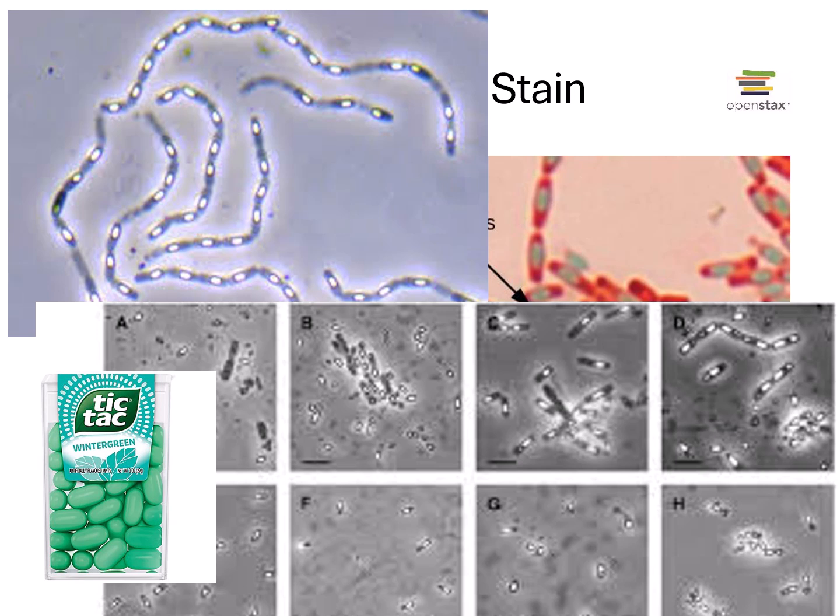The endospore stain is great, but there are some drawbacks. One is it takes some time, so you need to steam the malachite green, forcing it into the endospores. Another is that when the cells are young, they might not have very many endospores. So older cells are much more likely to produce endospores. And older for bacteria means like 2 or 3 days old. A week old, you'll have lots of endospores if these are endospore producing cells like Bacillus or Clostridium.